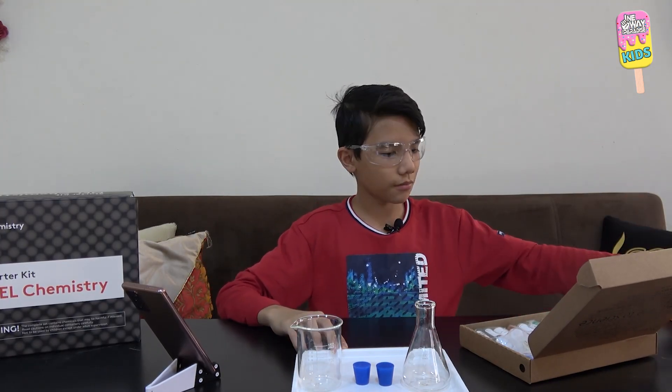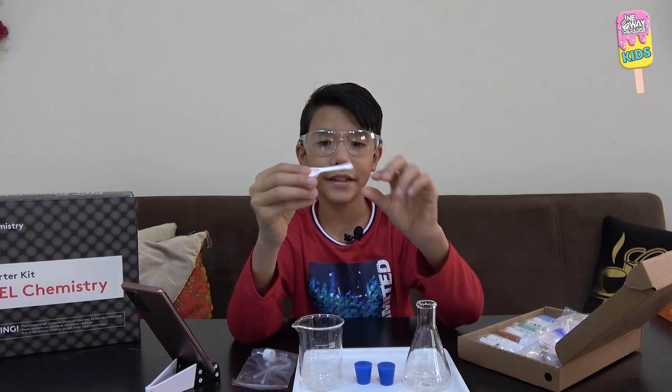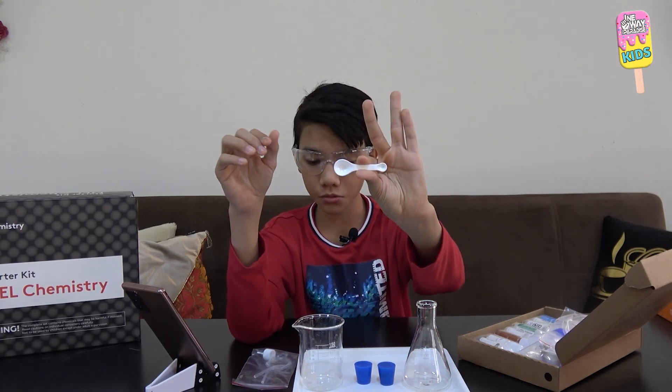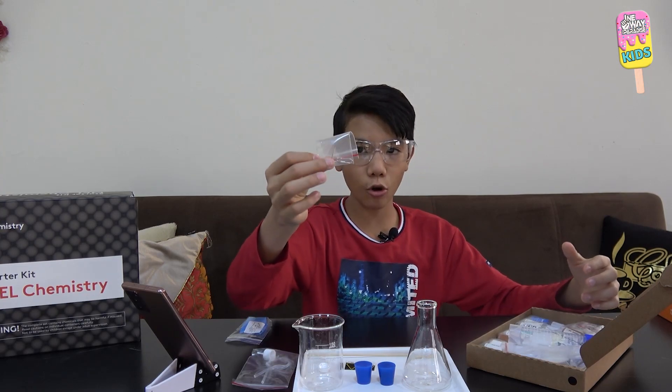I'll take the bottle nozzle and the silicon tube, a double-ended measuring spoon, thermochromic sticker, a wooden splint, some gloves, and a pin opener.